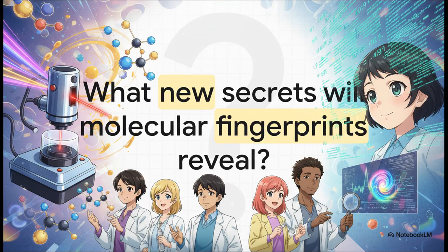And the craziest part? The technology isn't stopping there. The sources we reviewed point to cutting-edge advancements like optical photothermal infrared, or OPTIR, which combines a pulsed laser with this foundational physics to generate chemical images at sub-micron spatial resolution, literally without even needing to prep the sample.